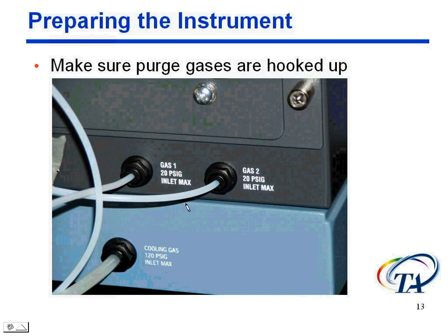Now, one of the things we need to make sure of is that the purge gases are hooked up. If we look at the back of the SDT, we'll see a port for 3 gases to come in.